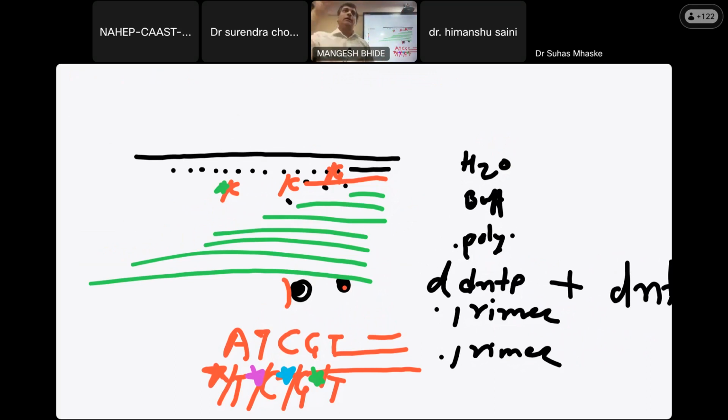Don't compare with NGS. In NGS, for example, what we saw yesterday, the DNA is going through the nanopore protein and it is reading the whole thing. In this chemistry, the DNA as such is not readable. DNA has to pass through the capillary or through the gel, and based on the length of the DNA, it will be separated, and then the separation will be read. So you will see the video now, and then we will come back to the questions.